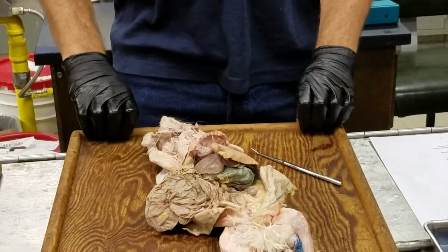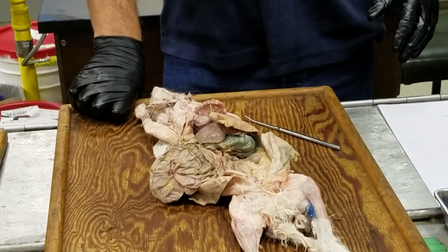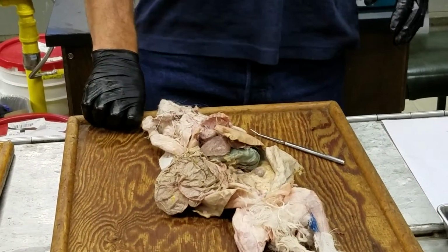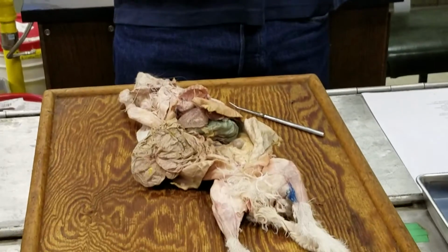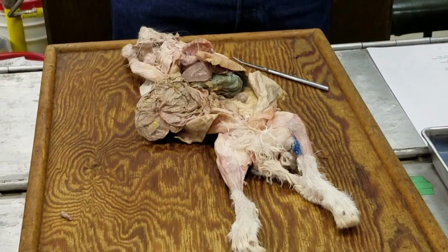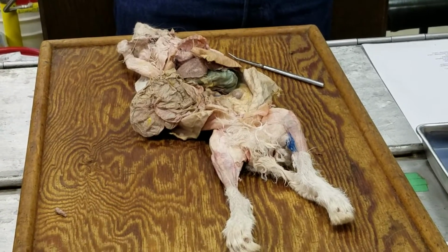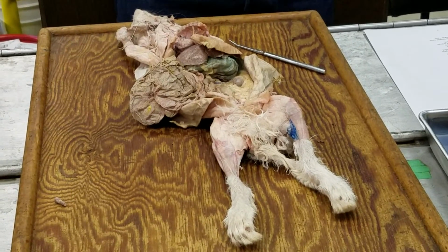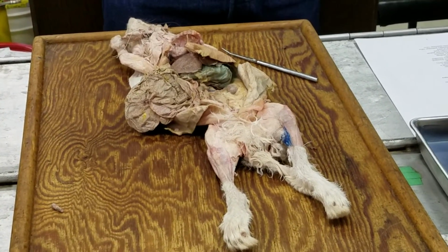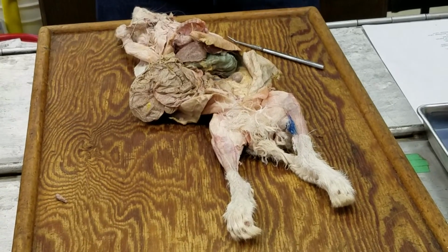And then the only other thing on the list was the lymphatic system, and I said, hard to see, but try, meaning give it a try, but it's really difficult, and I don't think any of you found it? Okay. If you find it, maybe I'll give you some bonus points or something, because I've never actually seen it in our cats or rabbits. I've seen it in people, which are much bigger and easier to find. Okay. But it's good to know about it. So, okay.